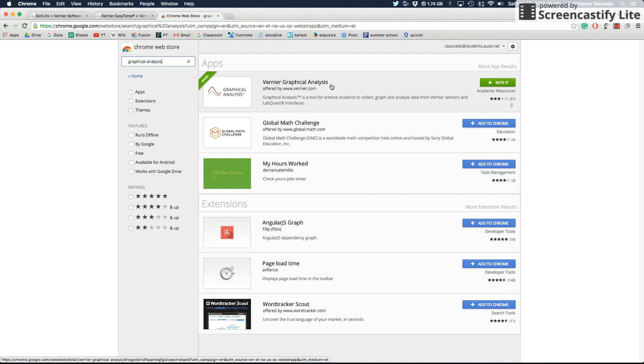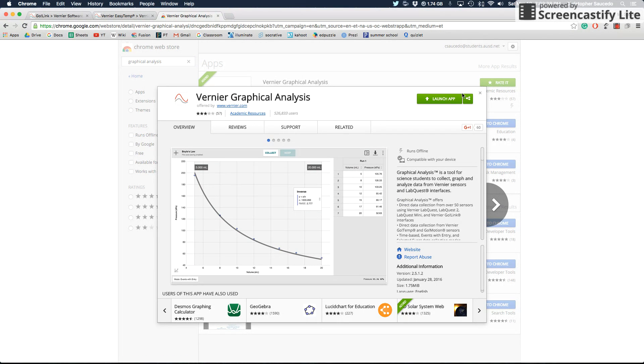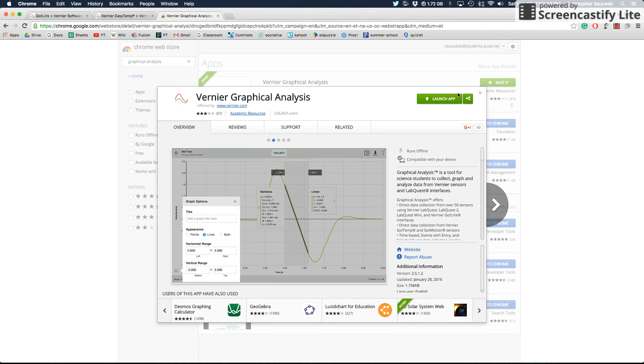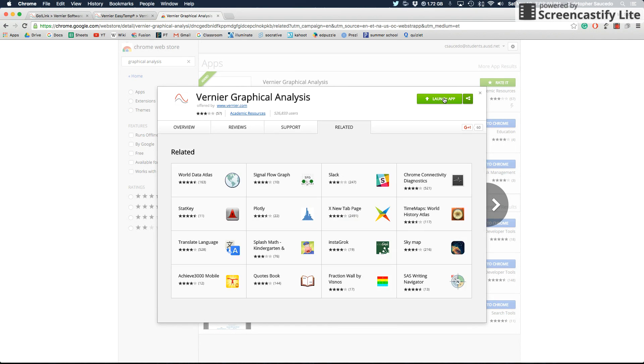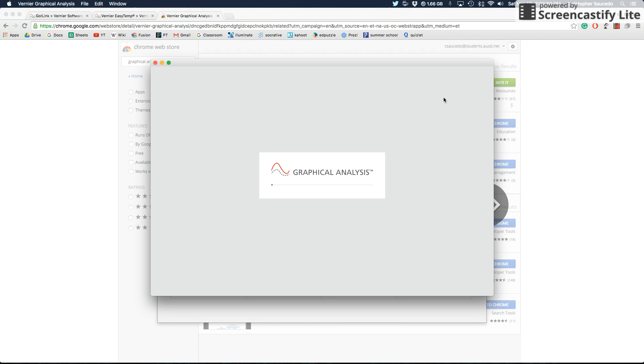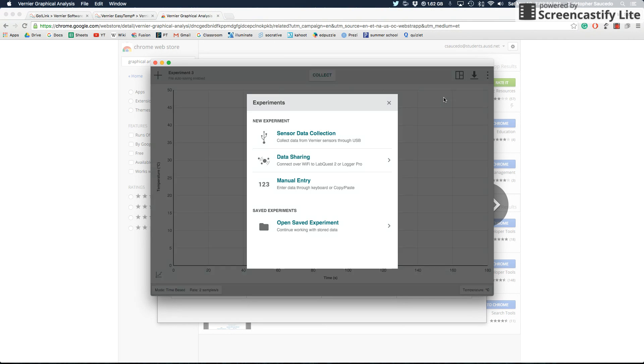When I click on that, it says launch app, but because you maybe haven't downloaded this before, it might say add to Chrome. So make sure that you add it to Chrome first and then launch it. And when you do that, it might take a little bit longer on a Chromebook.